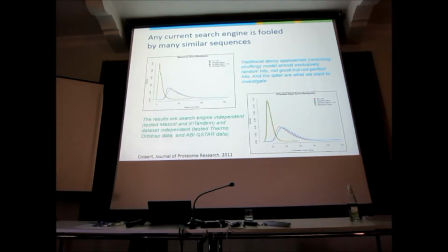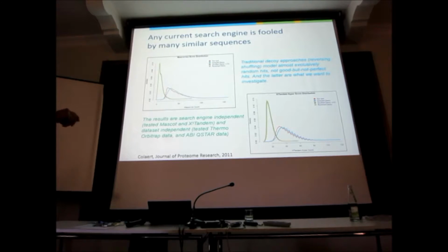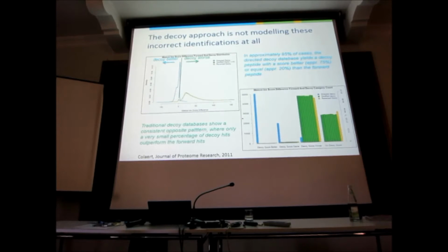Does everybody see the strange pattern in Tandem? So Tandem has this discretization in the score. Yeah? It comes from the formula of the hyperscore. So it's quite funny to see the sawtooth, which you don't have in Mascot. Although, if you look very carefully, there's a little bit of sawtooth pattern there. It has to do with the peptide length that is variable. Okay. What does that mean?